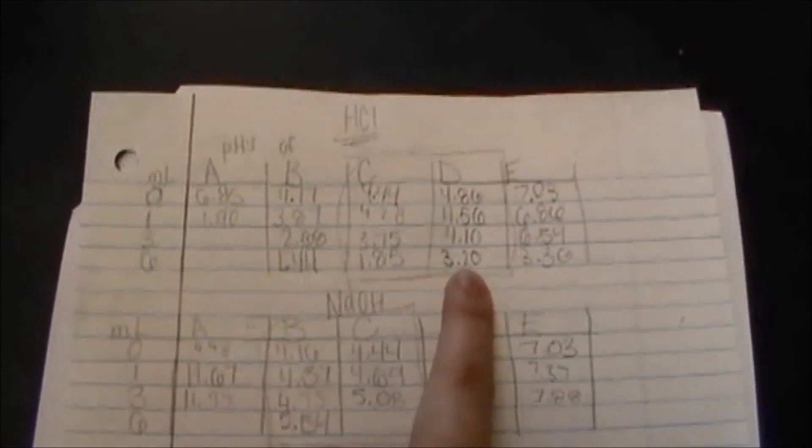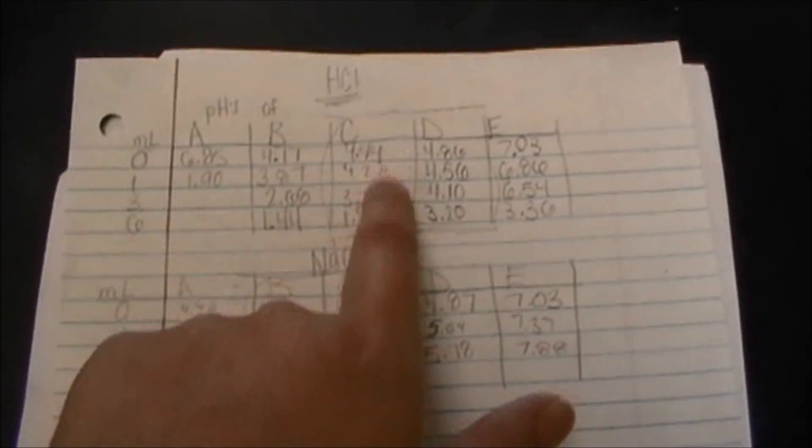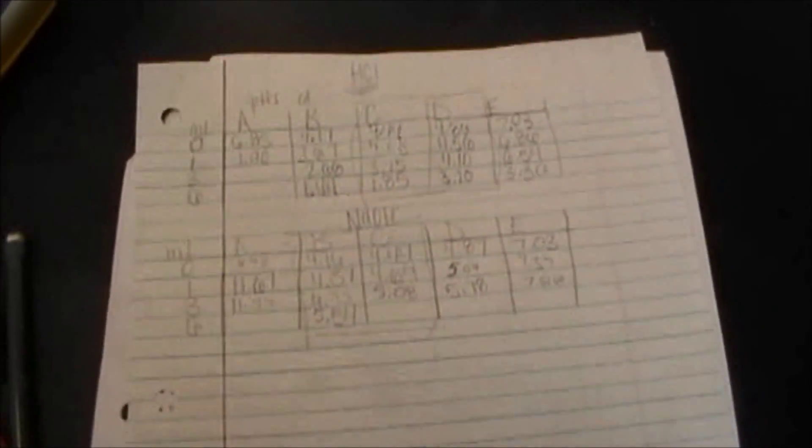And looking at our data tables, the consistent one for acid was C and D to be the best buffer to get a ratio of one. And then for NaOH, it's looking like it's going to be B and C. And so that makes C the consistent buffer solution for both acid and base. So that'll probably be the one that we're going to use for the next part of our lab.